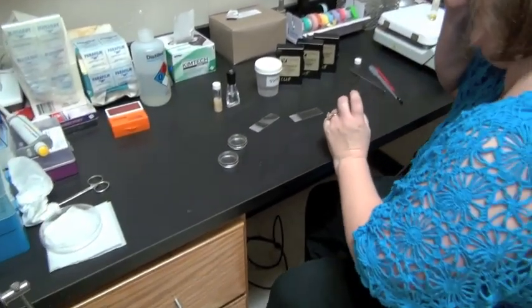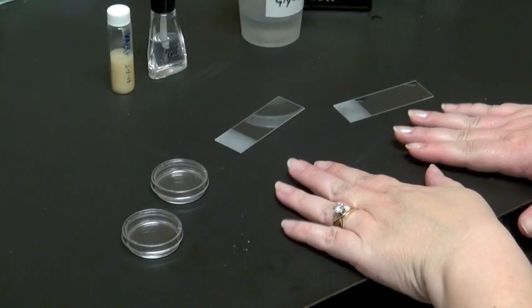And right now we're going to be looking at how to mount a cover slip onto a glass slide. And it's not as easy as it seems, and here's why. First of all, you need to make sure that you have the right materials ready to go before you start to mount your cover slip. You don't want to get things in your hands and then not be able to grab what you need.